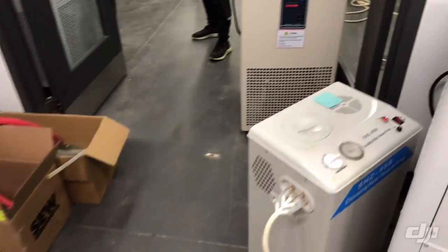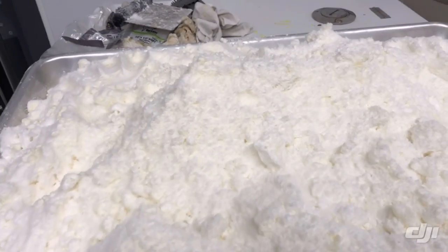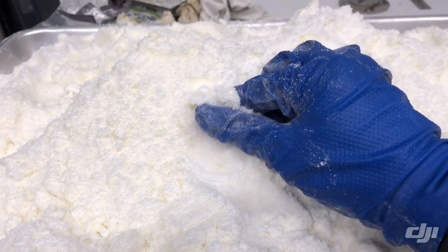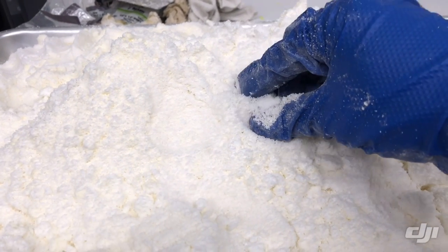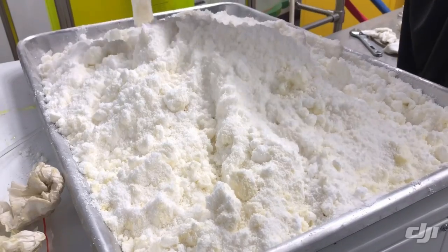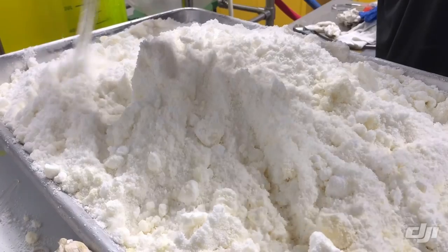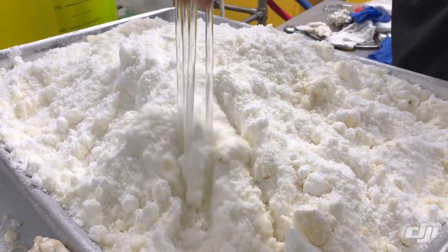Let's take a look at the CBD isolate that we made. This is the CBD isolate — it's like a powder with no odor, a super fine powder. The CBD potency of this isolate was tested at 99.6 percent. It's super pure after just one wash, and this is the outcome.